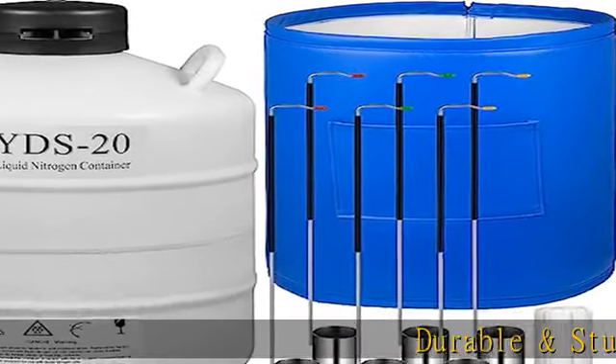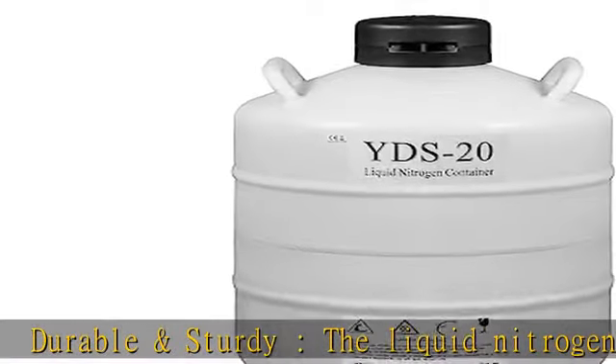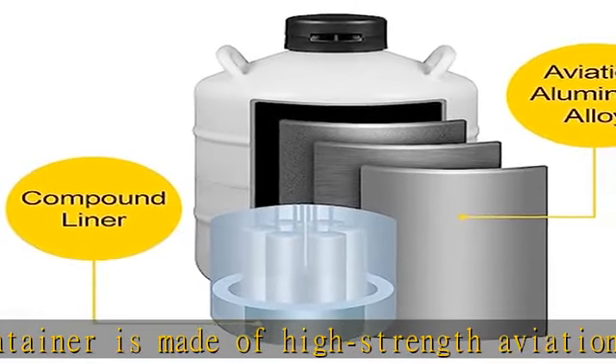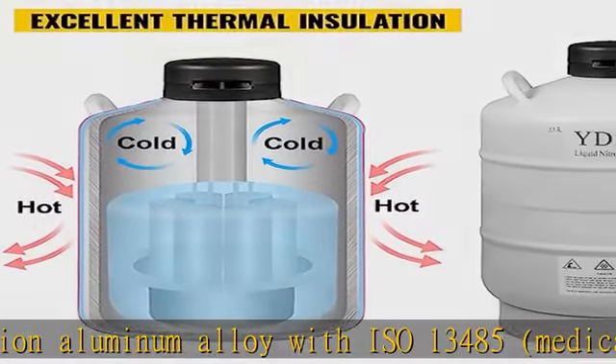Durable and sturdy, the liquid nitrogen container is made of high-strength aviation aluminum alloy with ISO 13485 medical equipment standard and APROGAS MDD certification, which can protect liquid nitrogen and samples in the tank. No worry about scratches or deformation due to improper operation.